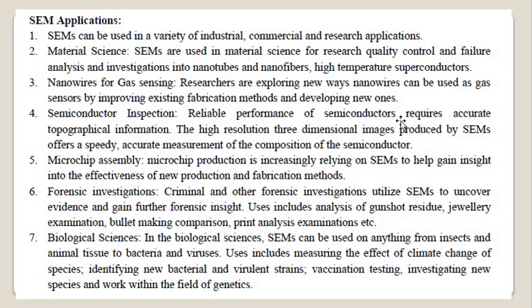So reliable performance of semiconductors requires accurate topographical information, and the high resolution three-dimensional image produced by the SEM offers speedy, accurate measurement of the composition of the semiconductor. So for the preparation of the semiconductor, their all-angle study, the SEM will be helpful. And microchip assembly: for microchip production, this SEM plays a very important role, and is increasingly relied on to help gain an insight into the effectiveness of new production and fabrication methods.